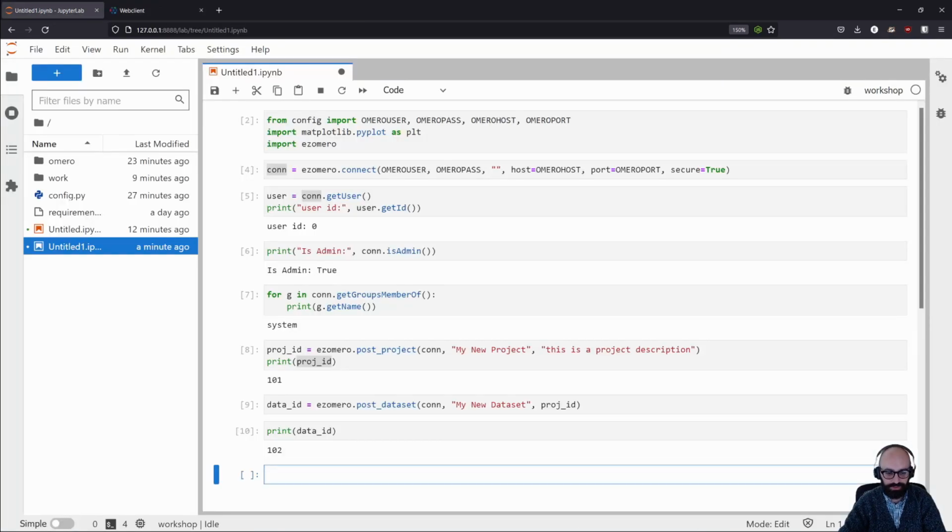So next thing we are going to do is adding an image to that dataset. Hopefully you have gone through the import process during the introduction to get an image there, so we could go through the introduction and retrieve that image. What we are going to show now is a different way to create an image in OMERO. It is created directly from a Python script. So you should be warned that the images you create this way, they are stored in disk directly as pixel values. So they are not an image file, which is not an issue if you have, for example, small analysis results. It should be avoided as the main way of adding images to a server.